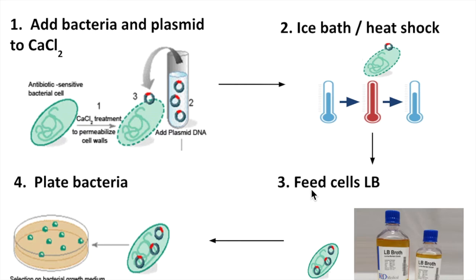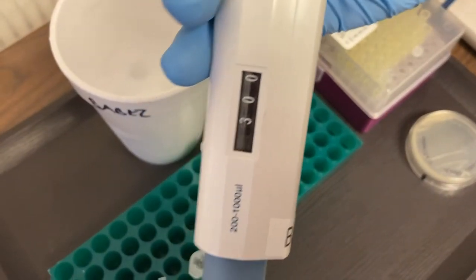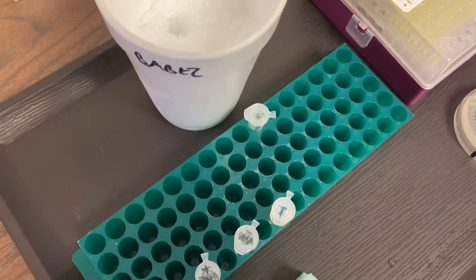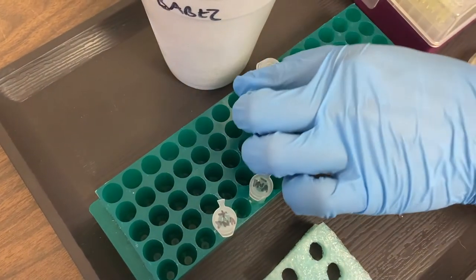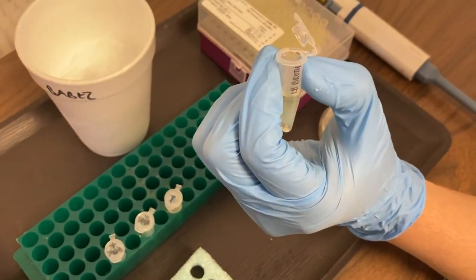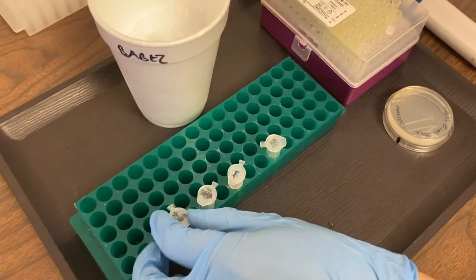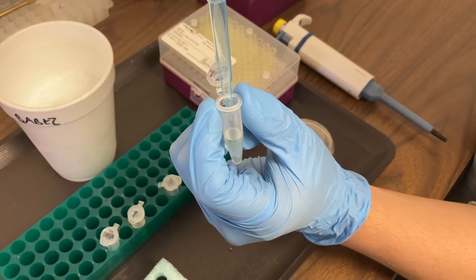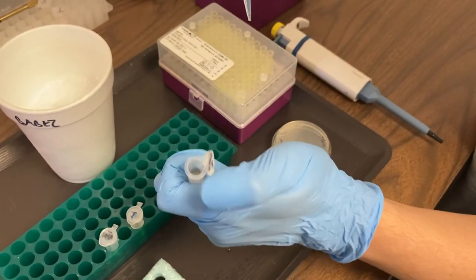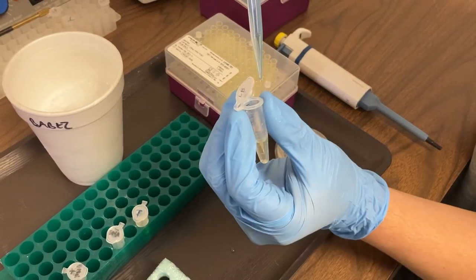That's why in part three we're going to take care of them by feeding them with something called LB. In order to do that we're going to take our micropipette and set it to 300 microliters. There's our LB at the top of the microtube rack. You can see it's yellow in color. What it has in it are sugars and amino acids that the bacteria need in order to be able to grow. So we're going to add the LB right on top to our plus DNA tube and we're going to add LB to our minus DNA tube.